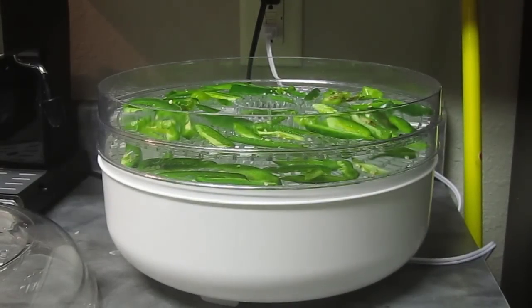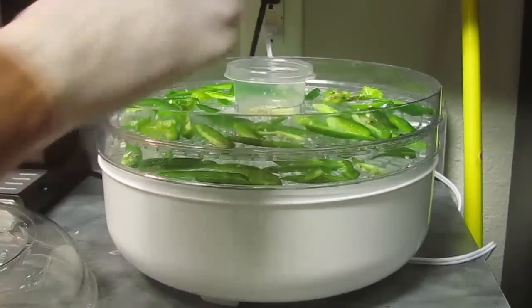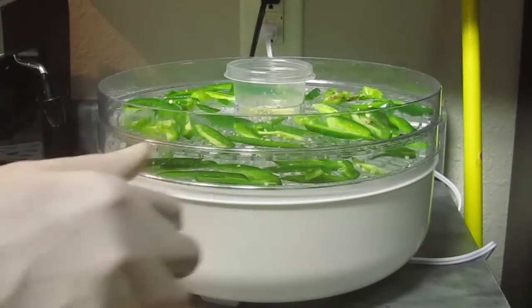I just threw it all in the food dehydrator overnight, and by the end they were pretty crunchy.